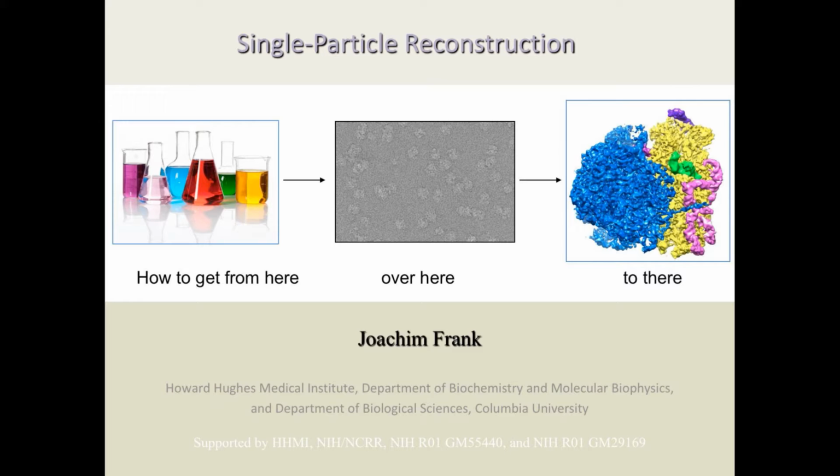Yeah, I'm fine. Okay. So I wanted to talk about single particle reconstruction and essentially go into a lot of conceptual details that were in fact part of the initial development of programs. And these are concepts that are very useful, and maybe sometimes you don't come across them because you're working with entire packages, which I would call black boxes.